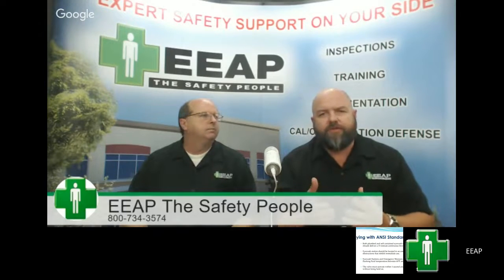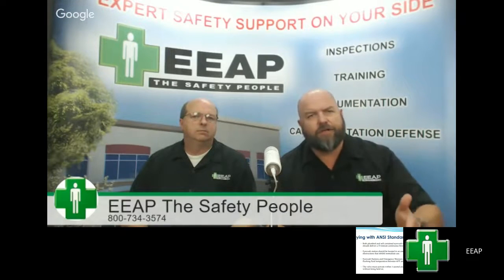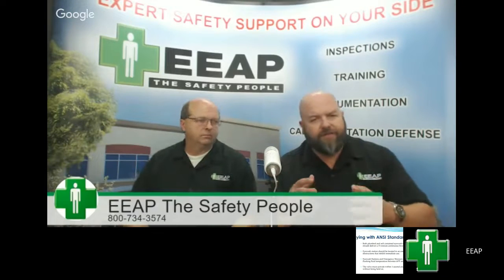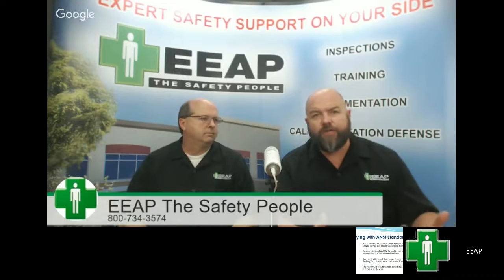Even though we think that they're helpful to the cause, I really believe that if somebody has an emergency or they have a need, you get them as soon as you can to the thing that's compliant with Cal OSHA. That's the 15-minute eyewash station flush. Because if they go to this one and they are put off by chance, or they get there and it doesn't do the job, now they're scrambling to get to the real eyewash station that they should have gotten to in the beginning, and more damage can occur to the eye. And so I'm not a big fan of the little squirt bottles.